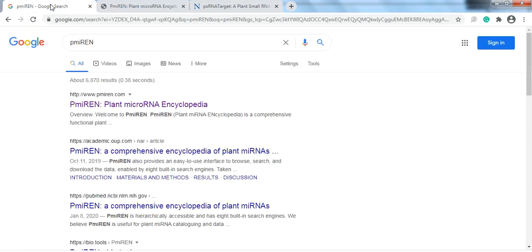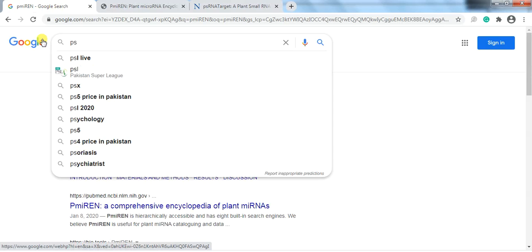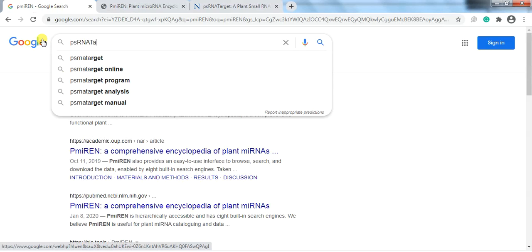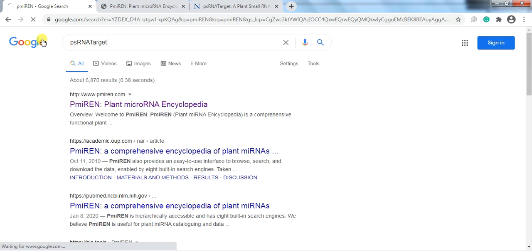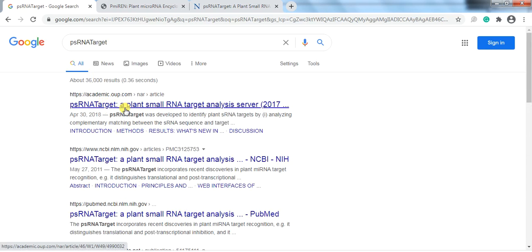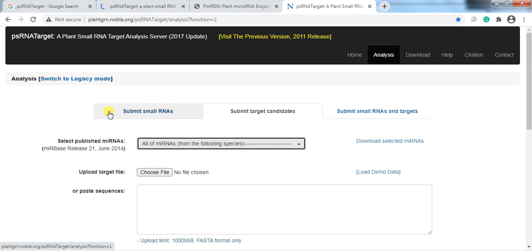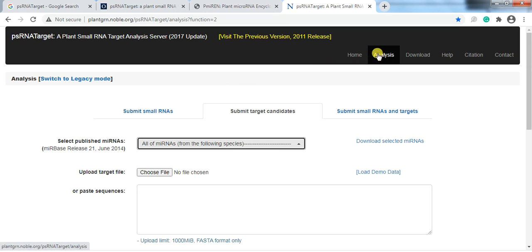Now go to Google and search 'psRNATarget.' Open the link. You will find three sections — when you click on 'Analysis,' you find three types of input options.